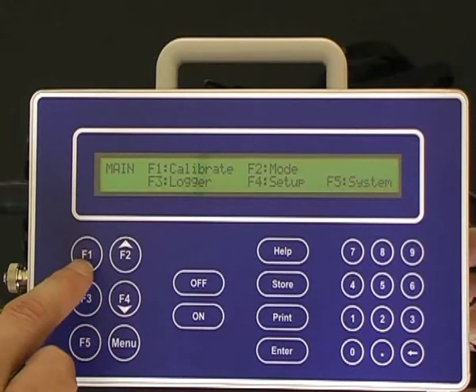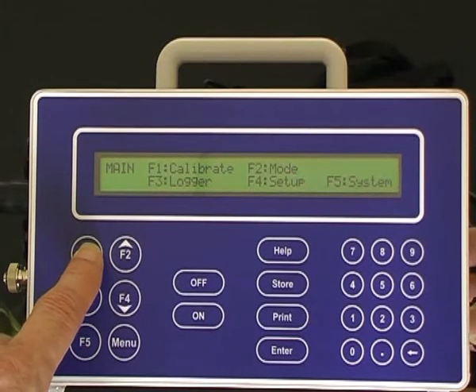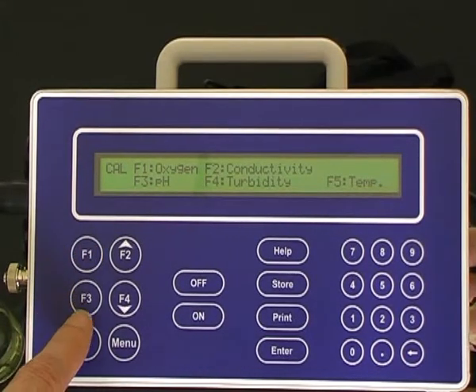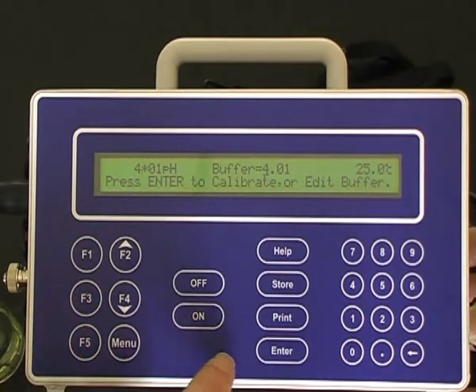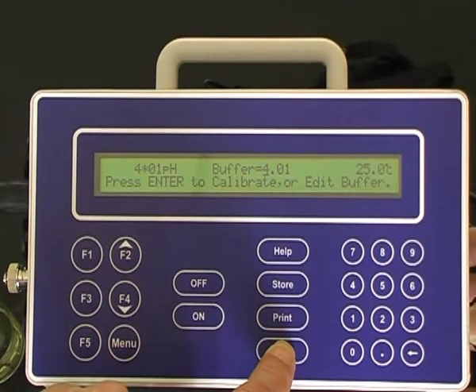To calibrate the first point of pH, press F1 for calibrate, F3 for pH. Once the pH measurement has equilibrated or settled, you then press enter to calibrate for pH buffer 4.